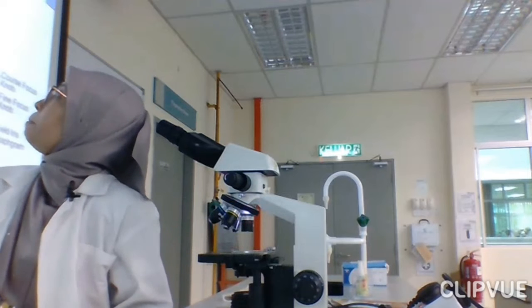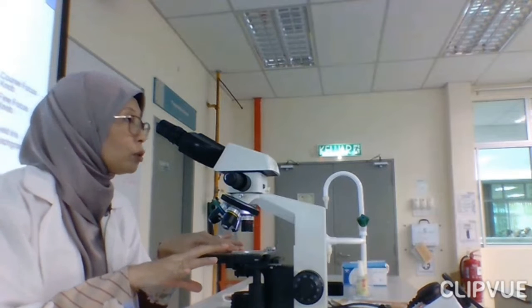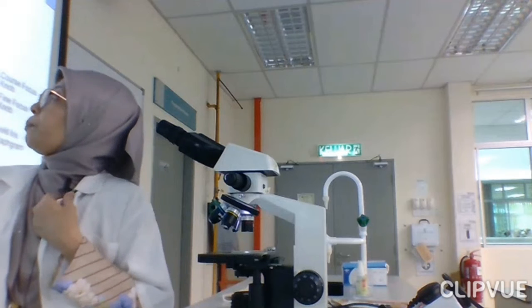There are four objective lenses altogether mounted on the revolving turret. The four objective lenses. The mechanical stage, I've introduced to you, is where you put the slides with a clip holder. You can bring the mechanical stage upward and downward.